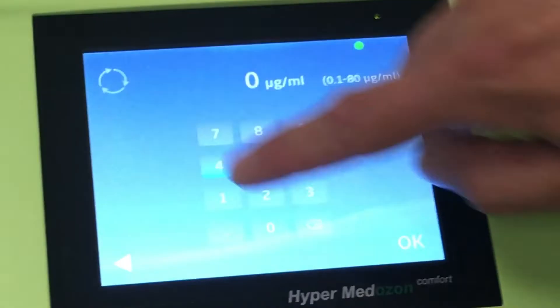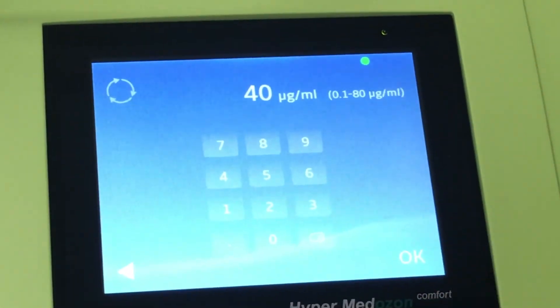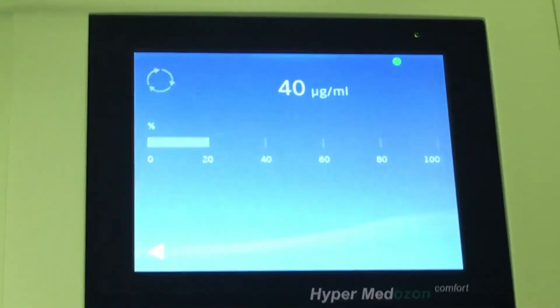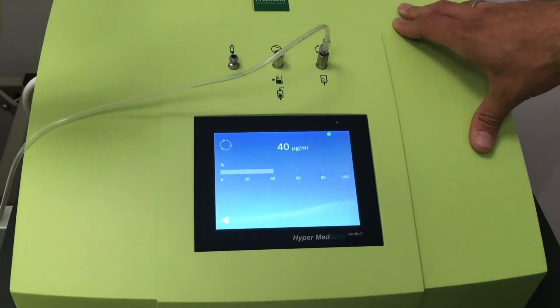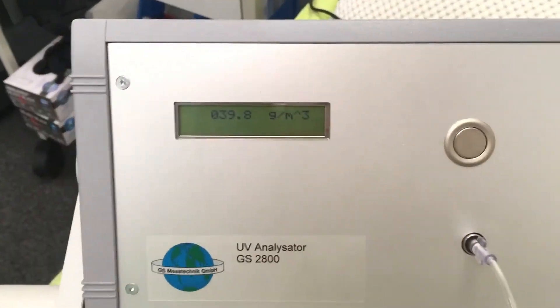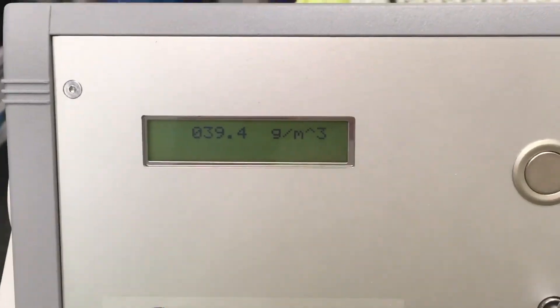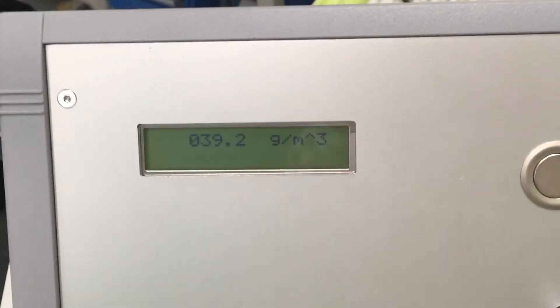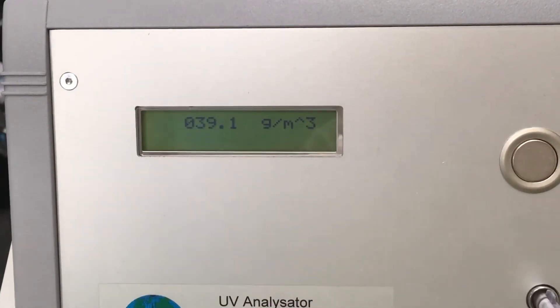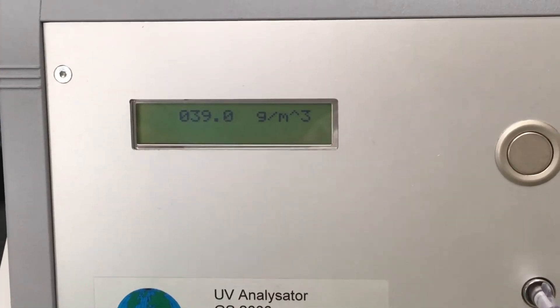At 40 micrograms per milliliter, the analyzer showed 39.3, 39.1, 39.3.